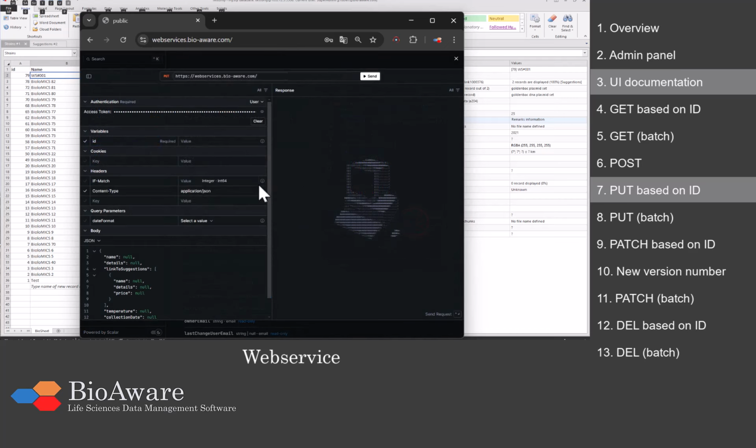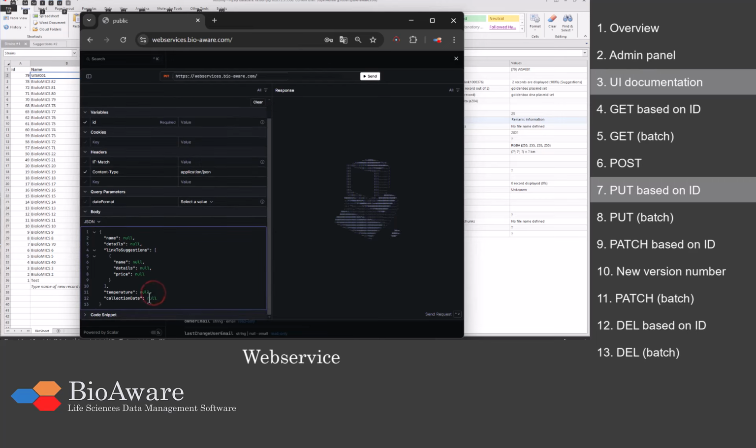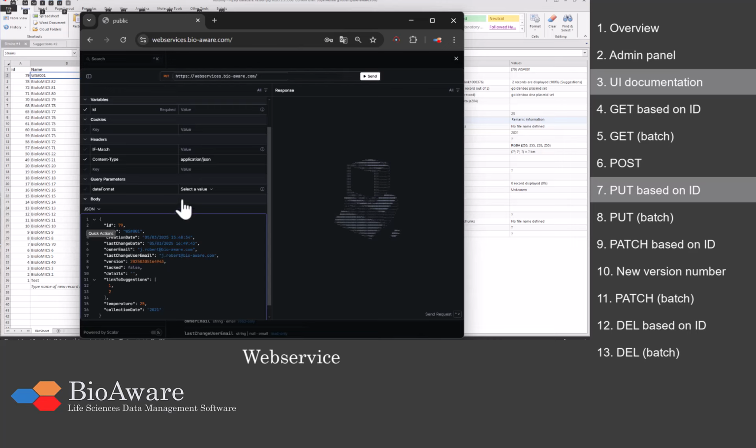In the body we paste the code from clipboard. The ID and the version number can be taken from the code. Enter the ID in the variables section and the version number in the headers.